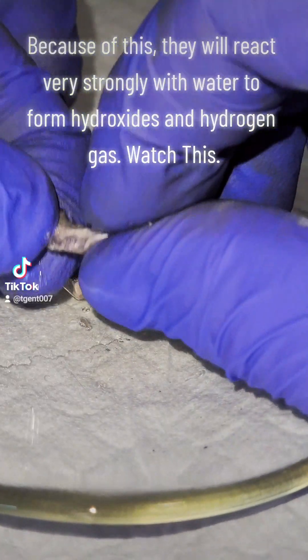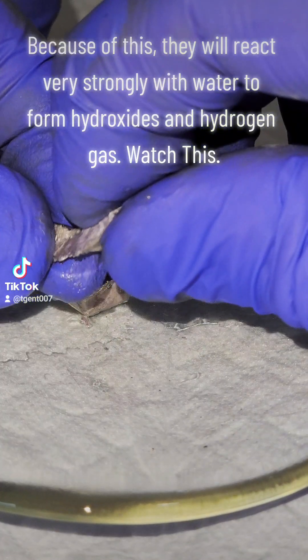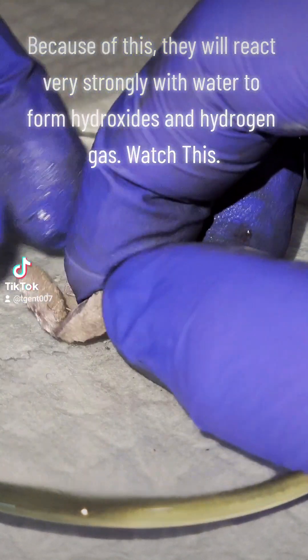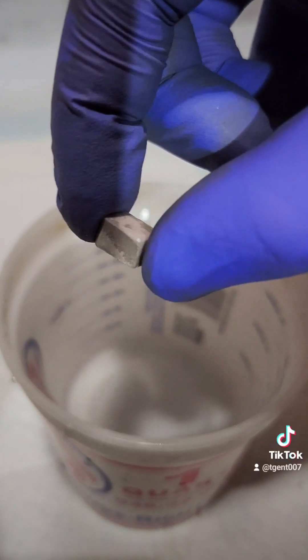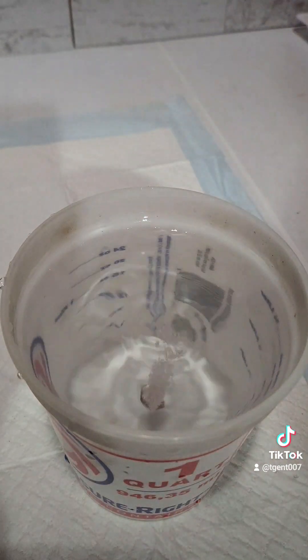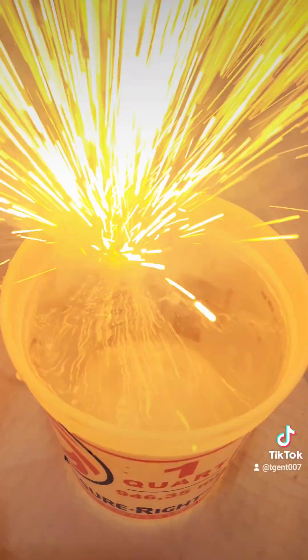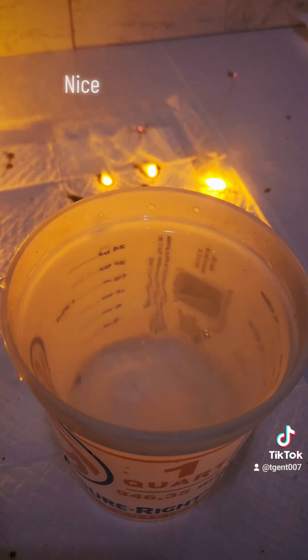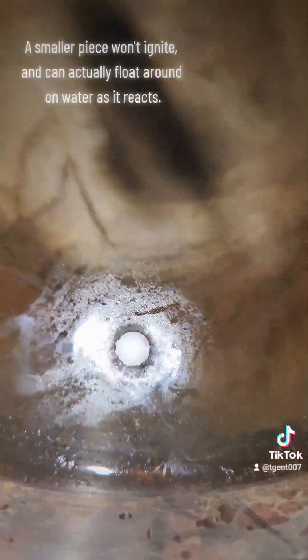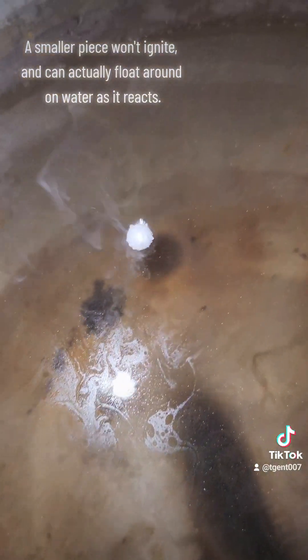Because of this, they will react very strongly with water to form hydroxides and hydrogen gas. Watch this! Nice! A smaller piece won't ignite and can actually float around on water as it reacts.